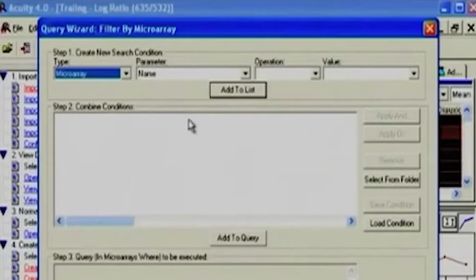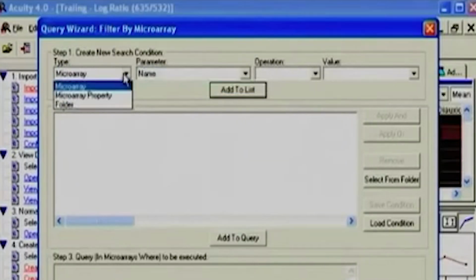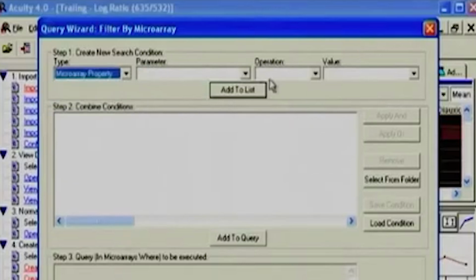Say for example, quickly, here I can define which experiment type I want, or based on the parameters, I can say I want to import the data in the form of only one particular parameter. This is a little tricky, because if you have the same name multiple times, the data will be imported twice. So you need to make sure your folder is right, and that you have given only one copy.